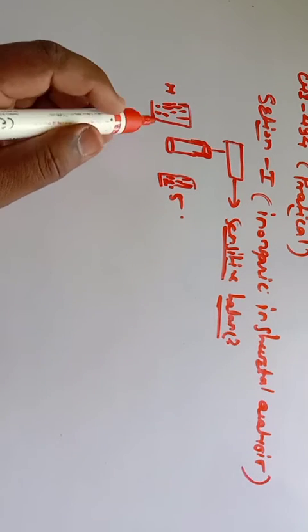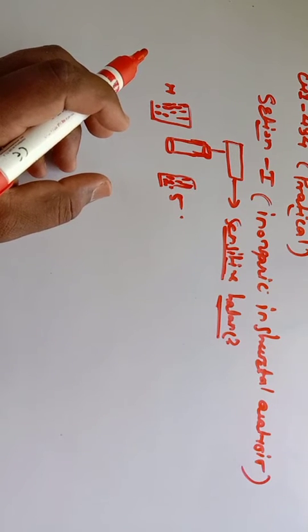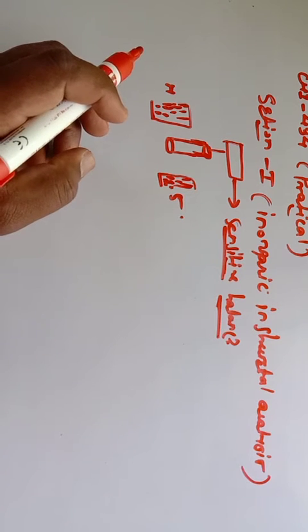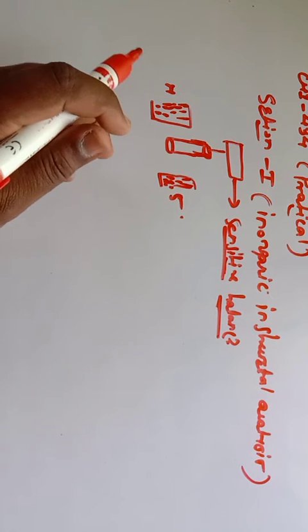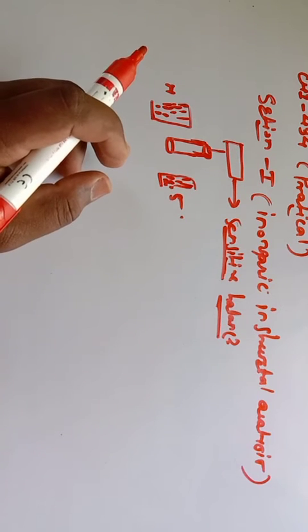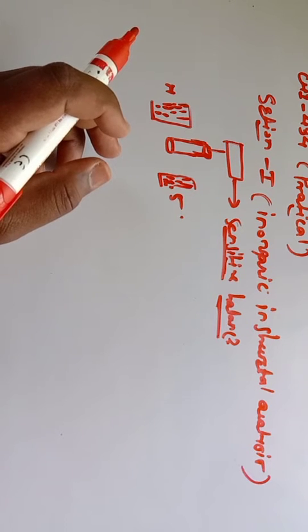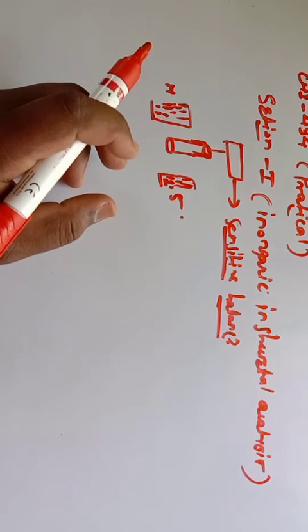We can consider the change in weight, because in this case you should first find out the weight of the sample without application of magnetic field. Let us consider it is W1 gram, and then the material is placed in the magnetic field, and after that we observe the change in weight, that is, whether the weight increases or decreases.